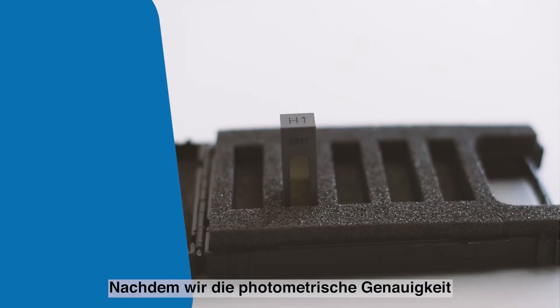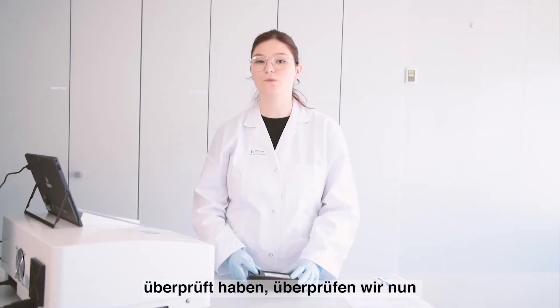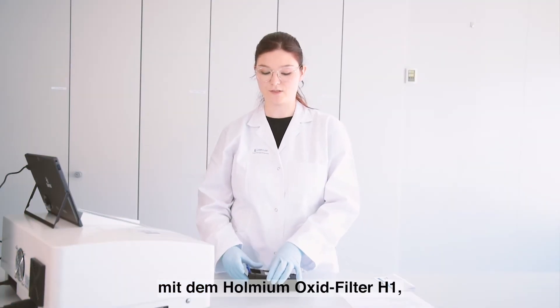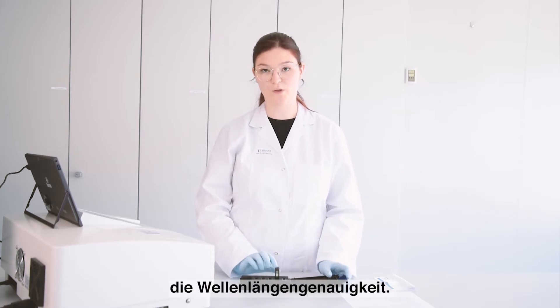After the calibration of the photometric accuracy, we will measure the wavelengths with the Holmium Oxide filter, which is called H1.